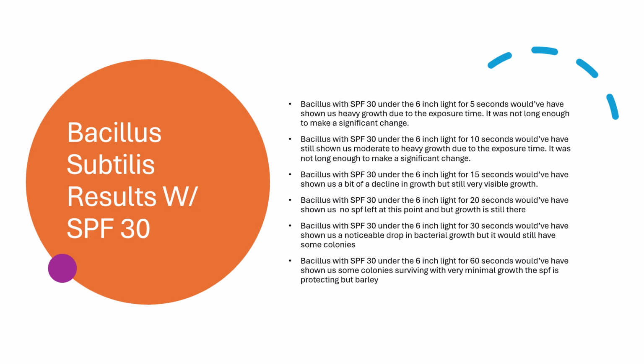And then we're going to move on up to 20 seconds, and this is at the point where we would have seen no SPF left, but the bacteria is still all there. Then we increased it to 30 seconds, and this is where we would have seen a noticeable drop in bacterial growth, but we would still have some colonies, not very many though.